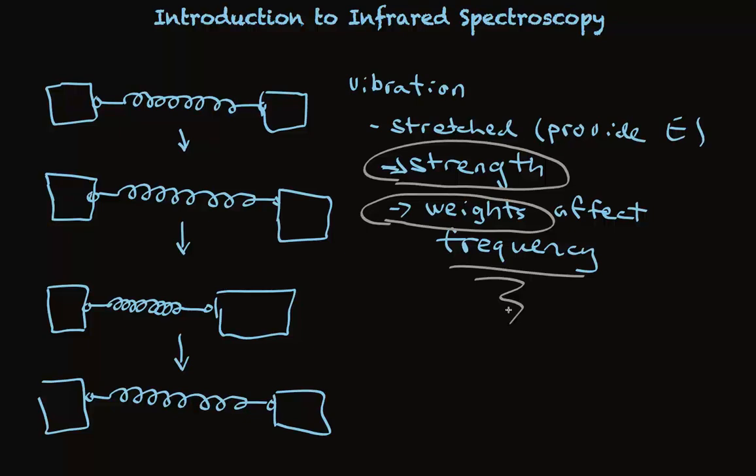But before we get there, I want to point out that this isn't the only kind of vibration we could imagine for this spring. Let's look at another example. Let's take a spring that has some weights on the ends.